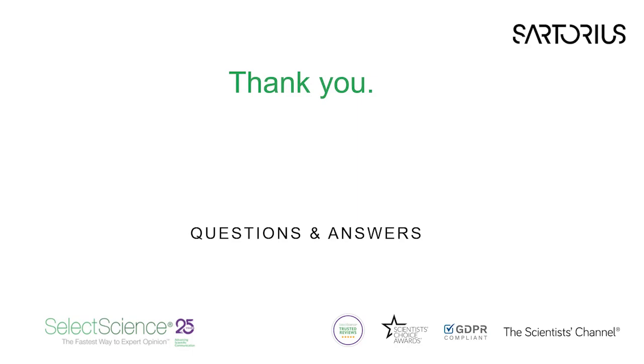Do you recommend mixing small amounts of liquid using a pipette? If that's what you're required to do, if you're adding two liquids together and they're a small amount, then yes, I would mix it before I pipetted it out, and obviously do it carefully. If it's a foaming liquid, it just depends. I'm not sure that I completely understand that question, but yeah, if you put two liquids together, I would mix them first. I think that's what they meant by that. Thanks, that was an interesting answer.